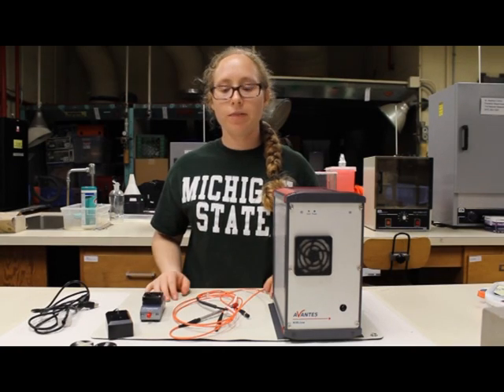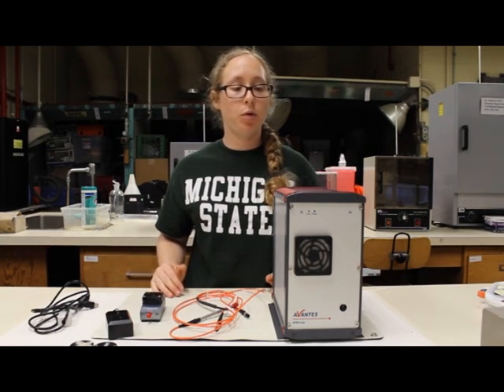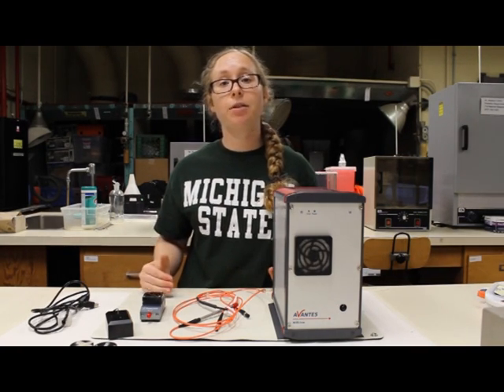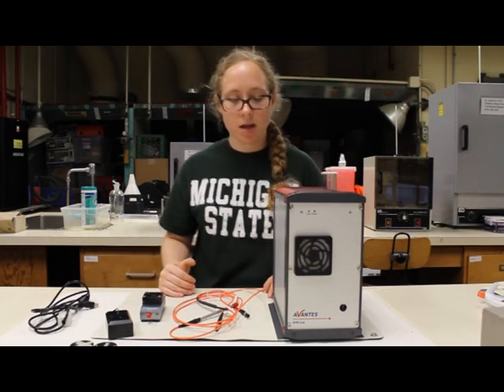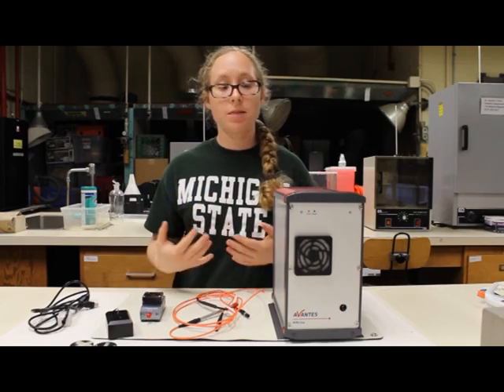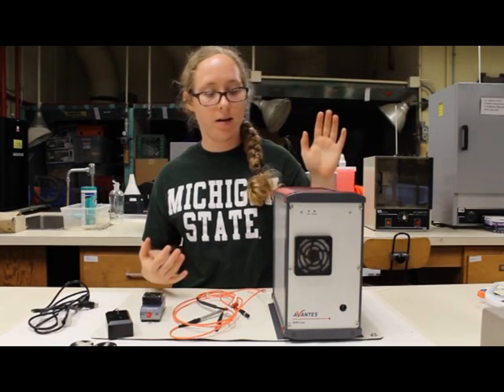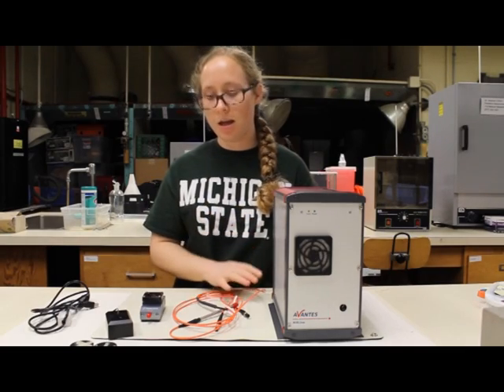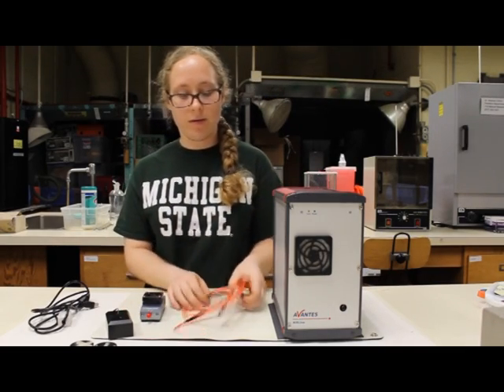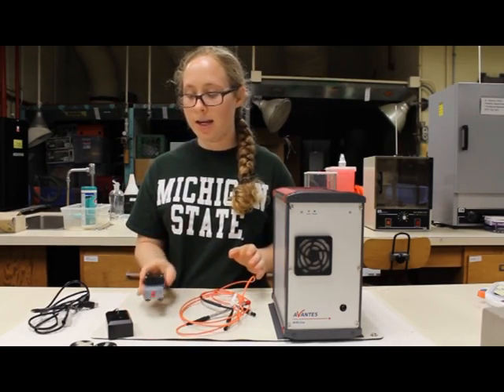This is a brief overview of the type of equipment used when collecting near-infrared spectroscopy reflectance measurements. In this setup, there is a spectrometer from Avantes in the near-infrared line, as well as a reflectance probe and a light source.